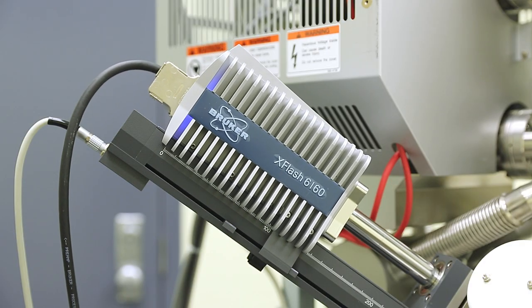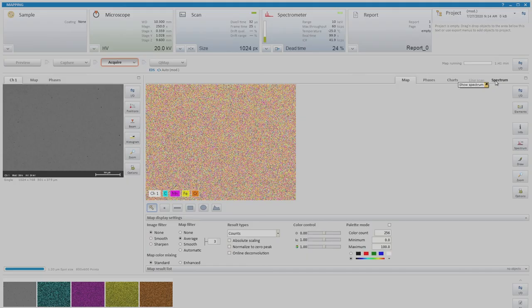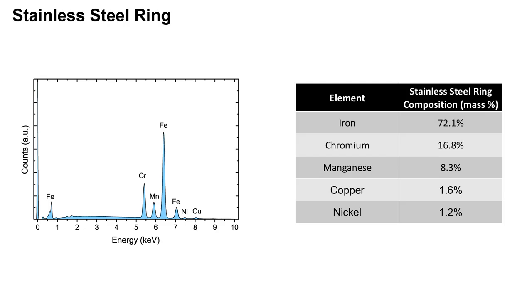To determine the chemical composition, I applied the energy dispersive x-ray spectroscopy technique in the scanning electron microscope. On the left is the spectrum obtained from this technique, and the peaks at specific energy positions represent specific elements. From this, the chemical composition and mass percentage is obtained. The stainless steel ring contains 72% iron, 16.8% chromium, 8.3% manganese, 1.6% copper, and 1.2% nickel.